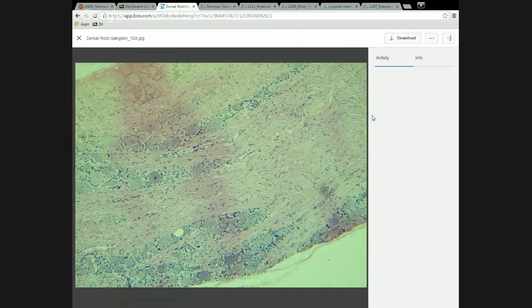The Merkel cells that are in that basal layer of the epidermis connect to some dendrites of these cells, making the Merkel disc, which is responsive to light touch on the surface of your skin. So these are all cells that are receiving those stimuli from the skin or from other structures in related senses. So stretch receptors in your muscles, in your tendons, or other receptors in your joints that can feel the direction that your joint's moving. Those cells are all these big cells that we see here. The bigger the cell, the longer the axon.